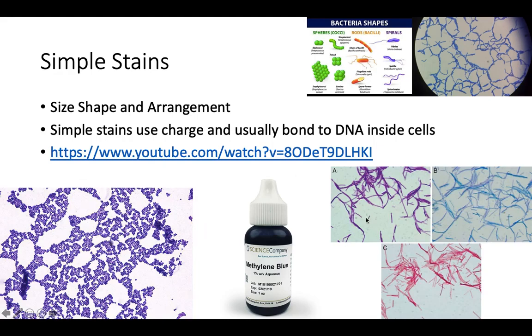You'll be able to tell how big they are. Are they little like this guy? Or are they large like him? You'll be able to tell that. And then you'll be able to tell one more thing, which is the arrangement. Do they come in clusters like this? This is Staphylococci arrangement, not the species, the arrangement. This is chains of bacillus, streptobacillus, little lines of bacillus, same up here. You can have random assortment where they're just blobbed across the slide. You can have tetrad arrangement, lots of different arrangements.